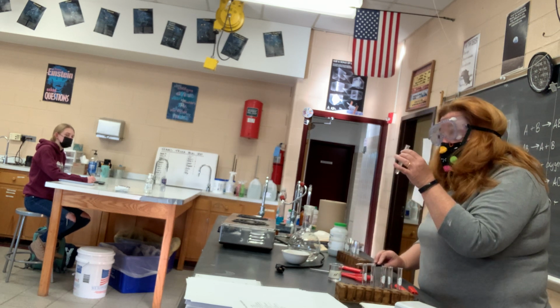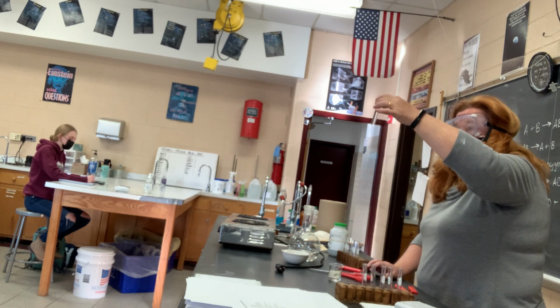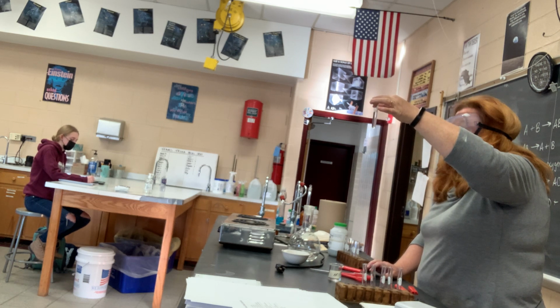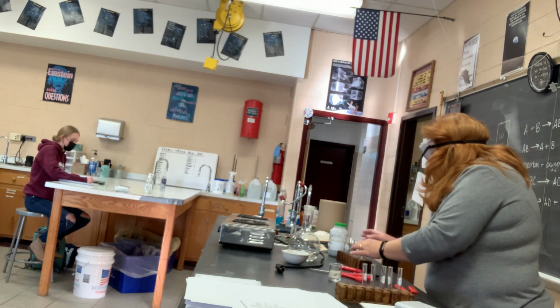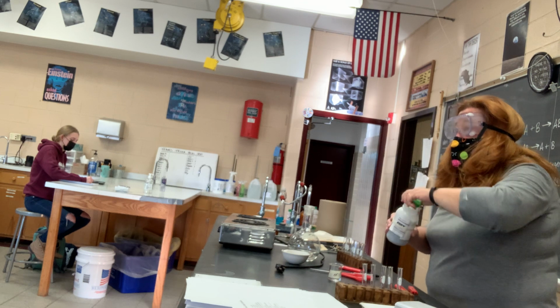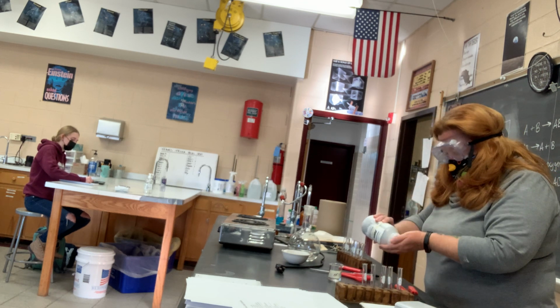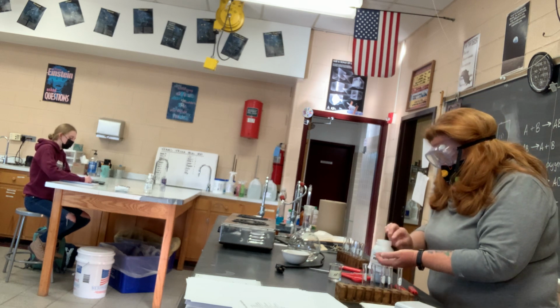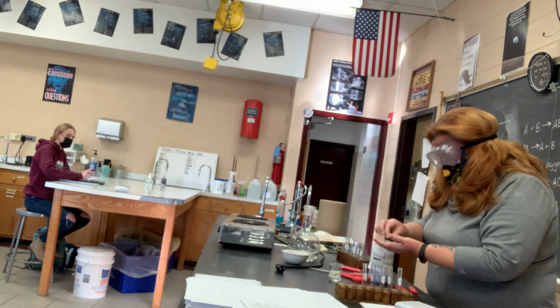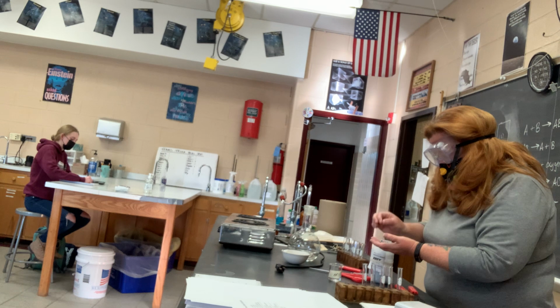So, reactants: hydrochloric acid. Hydrochloric acid is clear. It's one of the common acids. The formula is on your sheet. Zinc is what I'm going to add to this. It's called mossy zinc because of the way it's made. It looks like little pieces of moss. I'm trying to find one small enough to go in these test tubes.